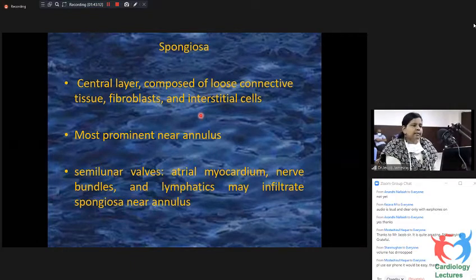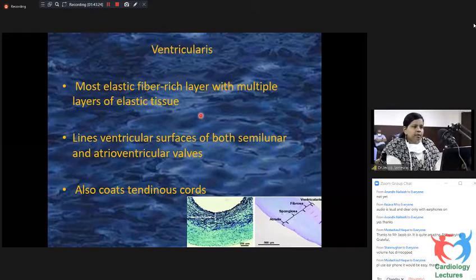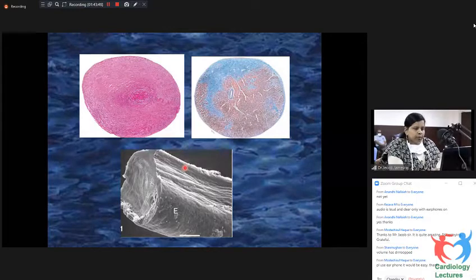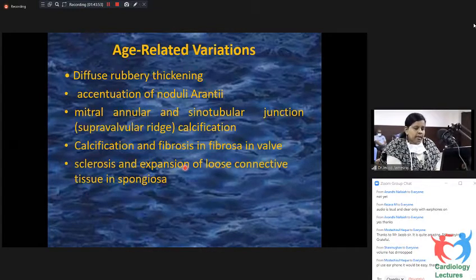So this is a papillary muscle, and you can see this is lined by the endocardium, and this is a section of the papillary muscle where there is linear orientation. So there are some mild differences in the arrangement of cardiac muscle in the atria and the ventricles. In the atria, the layers are present, but the myocytes are loosely arranged and some fat can be present. In the ventricles, it is more compactly arranged.